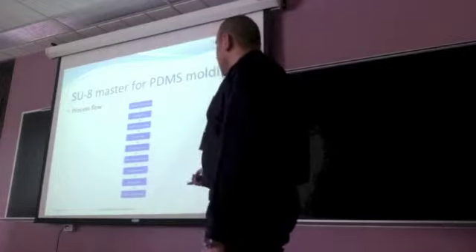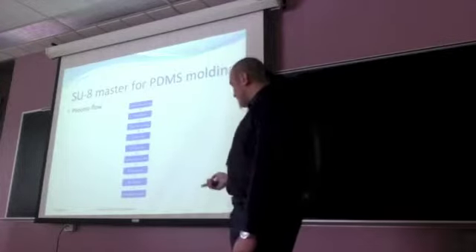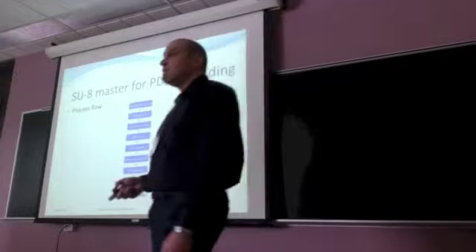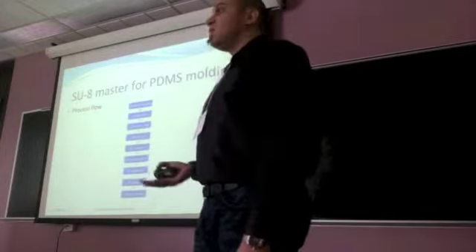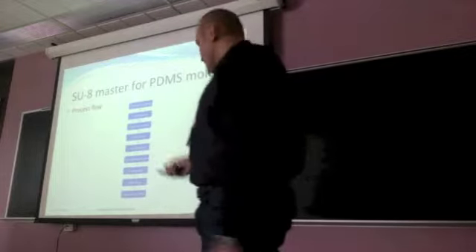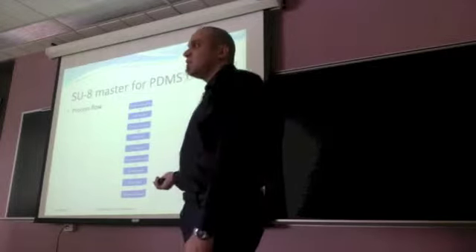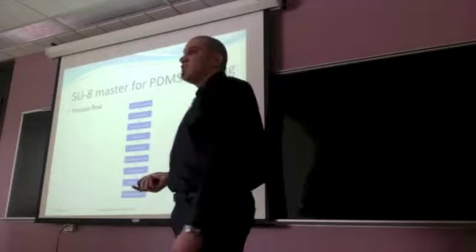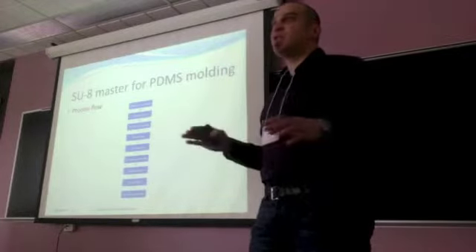Development. At this point, cracks can appear in the SU8 layer. This is a well-known problem, and it is due to the release of internal stress in SU8. To remove these cracks, a hard bake is needed, and our bake is done at 150 degrees for 5 minutes. It's above the glass transition temperature of SU8, so you will make it flow, and the cracks should disappear.